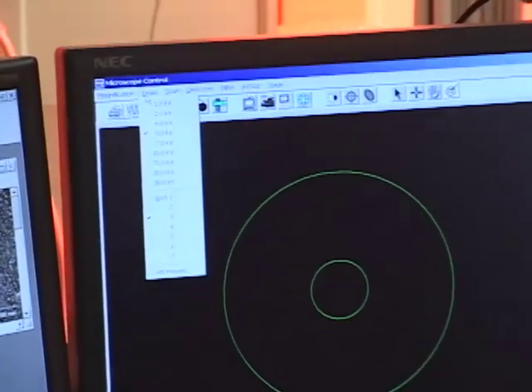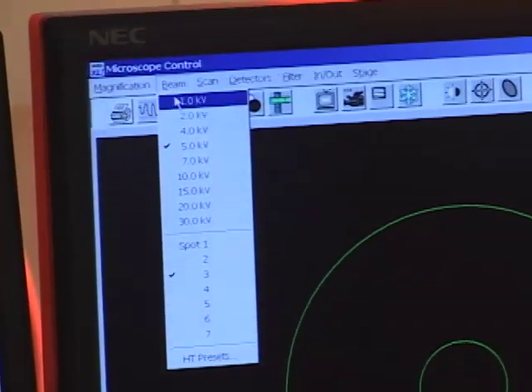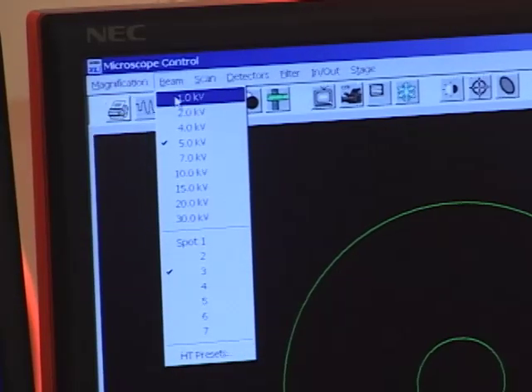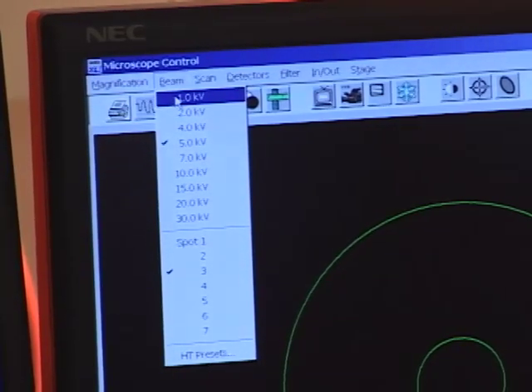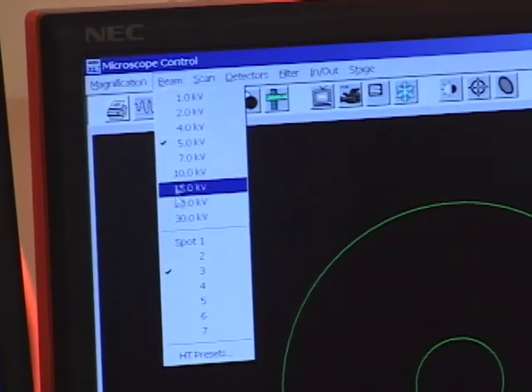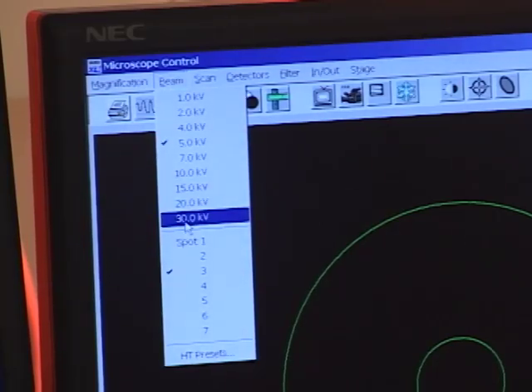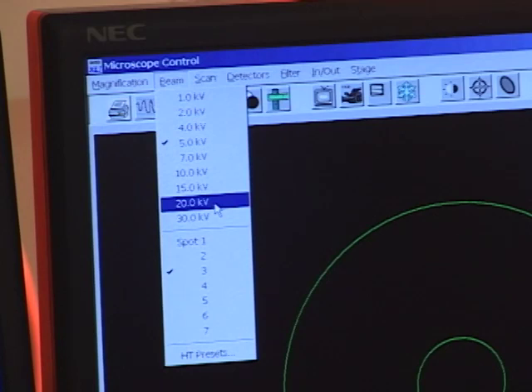The first menu here is accelerating voltage, which can go anywhere from 0.5 keV to 30 keV. Lower accelerating voltages are good for fragile samples like biological samples. Higher accelerating voltages give you better resolution. So any sample that conducts well enough to tolerate the high accelerating voltage, 30 keV or 20 keV, you want to use that because it will give you a better image in the end.